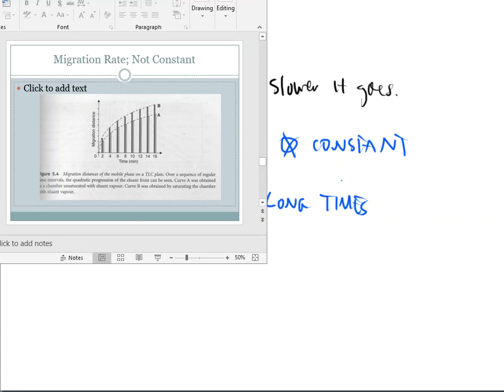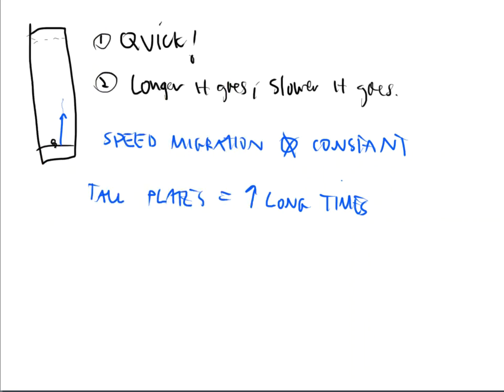So keep that in mind when you actually do the TLC plate development in the laboratory itself, and make sure that you put that lid on it. And now you know why.